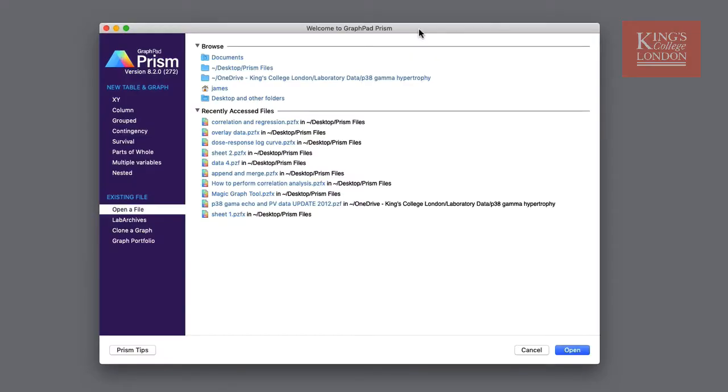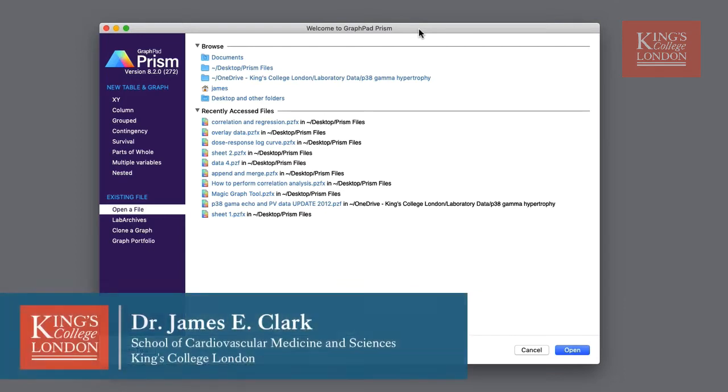Hello I'm James Clark from King's College London and in this short video I'm going to show you how to begin a new project in GraphPad Prism.